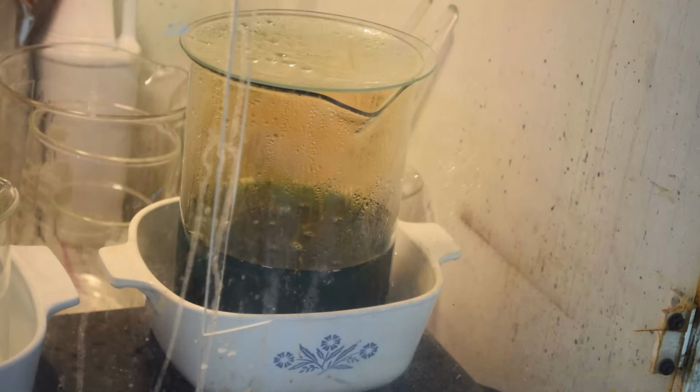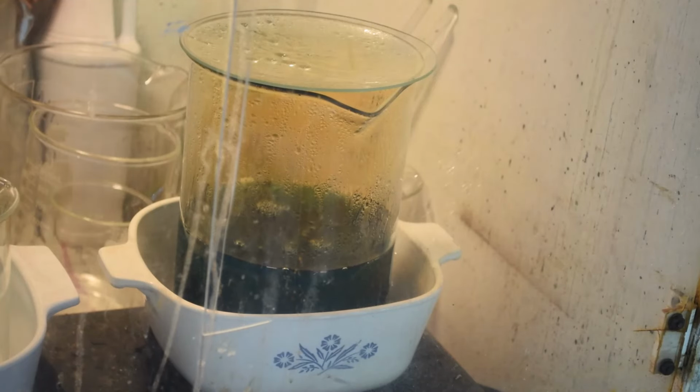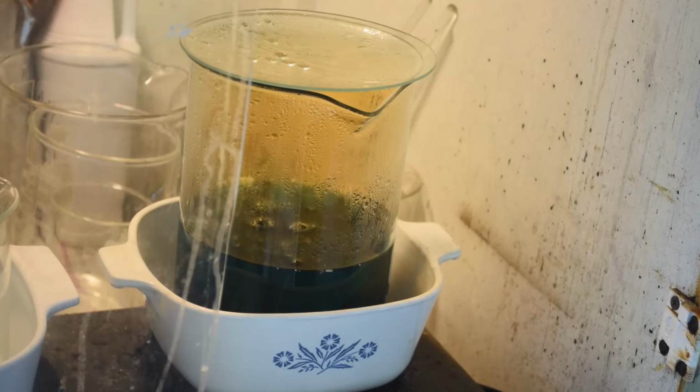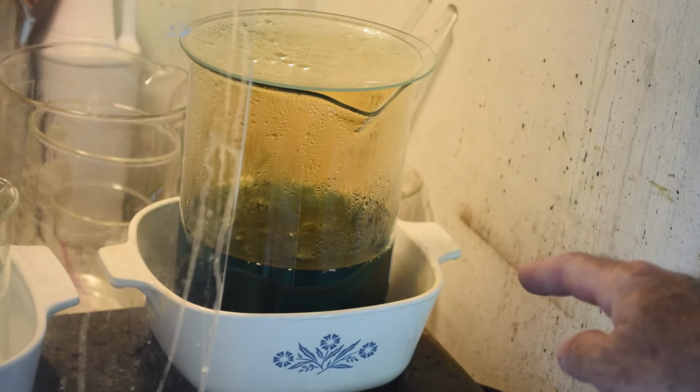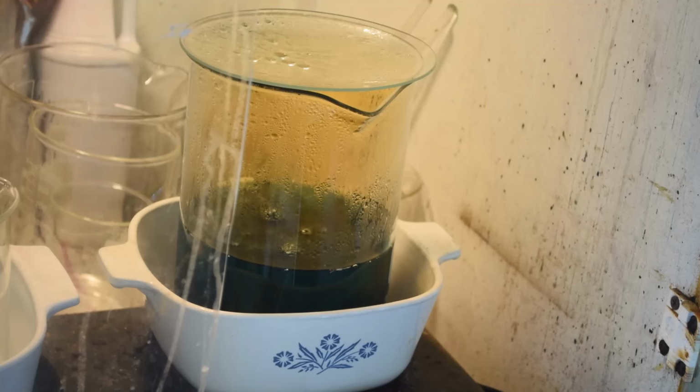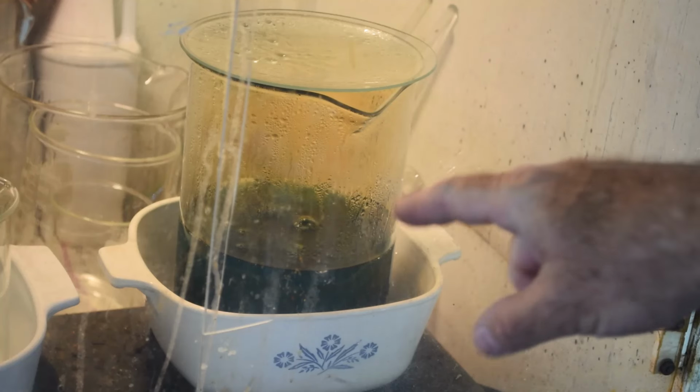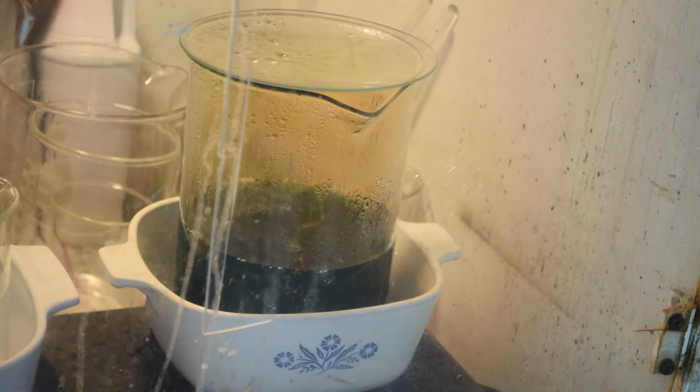Well, my goodness, I went away for 20 or 30 minutes to do other stuff, and we're still getting a pretty good reaction. I think maybe it's because it's heated up some more on the hot plate here. But look how dark green the color has gotten. Wow, that is really super dark green. And the more I see that, the more I'm thinking nickel. So I'm thinking there's some nickel in there. Maybe that's what that silvery metal on there was. Whether there's any palladium or not, well, that's yet to be determined. But I'll tell you what, this really dark green color may make it hard to tell with the stannous chloride test whether there's actually any palladium in there or not.